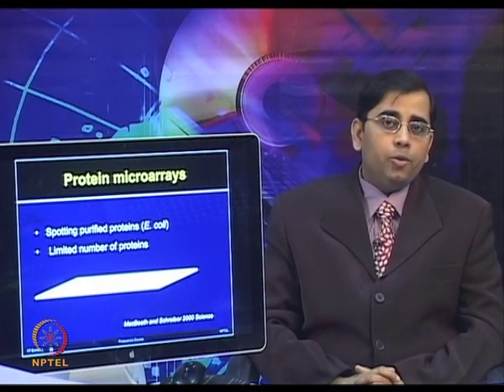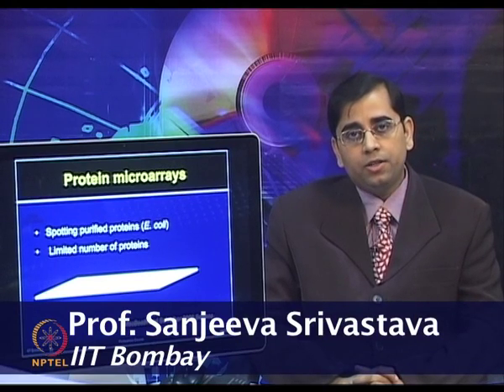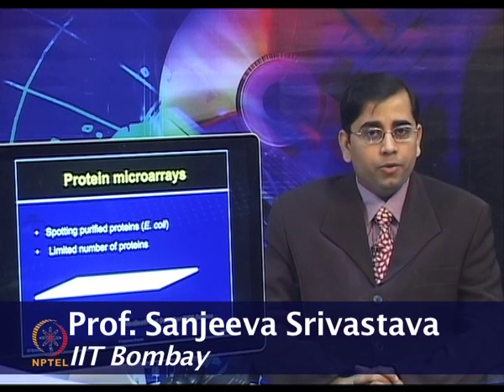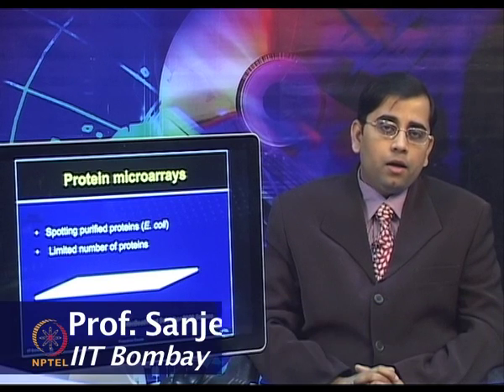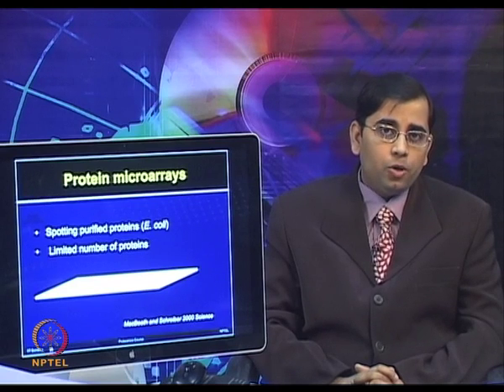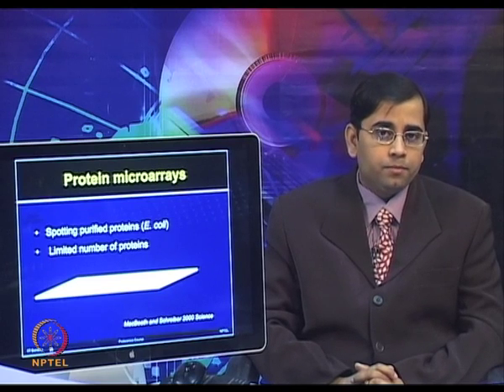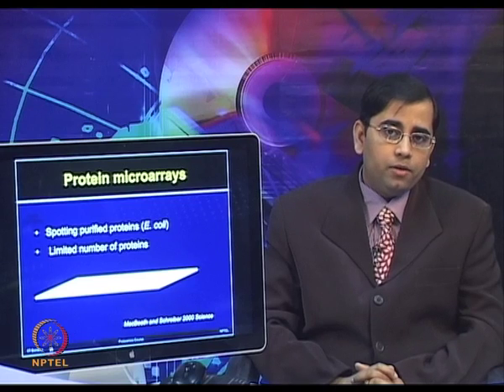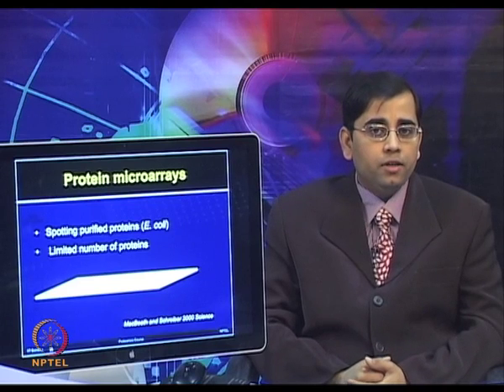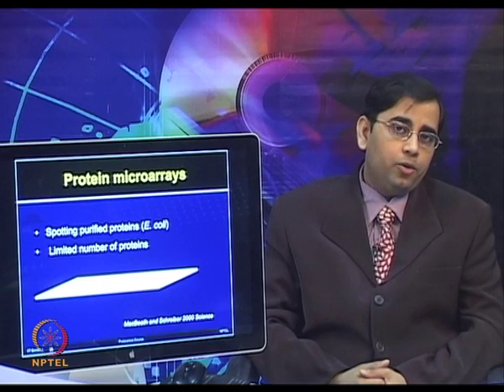As compared to the DNA microarrays, which have shown their promise and potential in various biological applications, there are relatively few studies published using protein microarrays. Protein microarrays still remain very challenging, just because the generation of the content, the protein, is very challenging. Gavin MacBeath at Harvard first demonstrated the feasibility of printing proteins on the chip surface in a high density array similar to DNA microarrays.